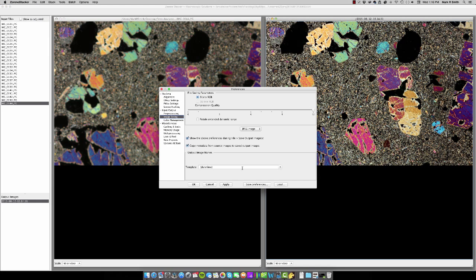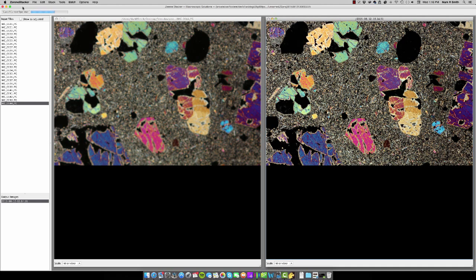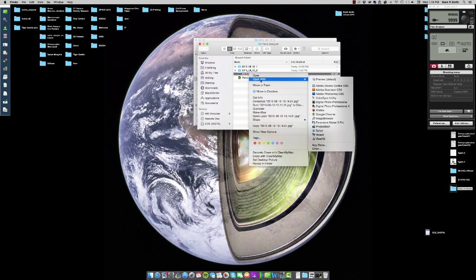I'll save this output image. I'll just save it as a JPEG for now for demonstration purposes. Then I'm going to open it from the folder and I'm going to open it up in Photoshop for you.